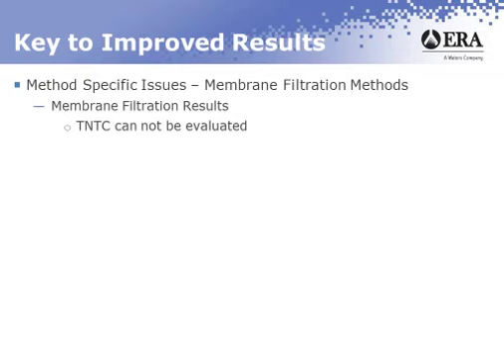One of the most important things you need to know about membrane filtration PT results is that PT results that are reported as too numerous to count will be evaluated as no evaluation. It's therefore critical that you run the appropriate dilutions. We'd also recommend, if you're running QC, that you routinely run them at various dilutions to simulate the PT scenario.